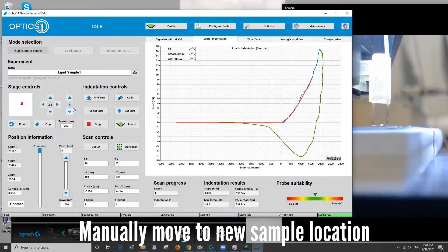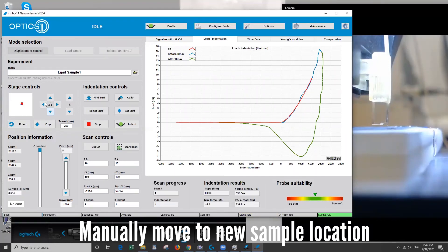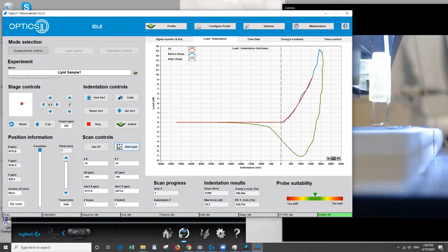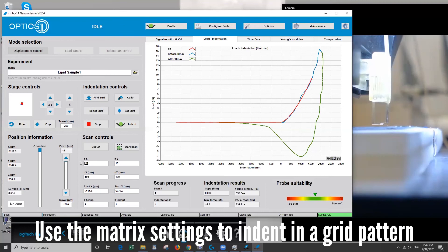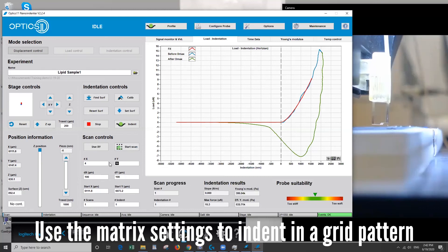So after this you can do a couple of things. You can raise the tip up and then you can move into a different direction to find a fresh spot to do another indent. If you want to do many indents without having to do it manually, you can use a grid. You can choose a number of data points. So this might actually be quite a lot. It will take a long time so maybe we'll do something smaller. And then you choose the distance between these data points.